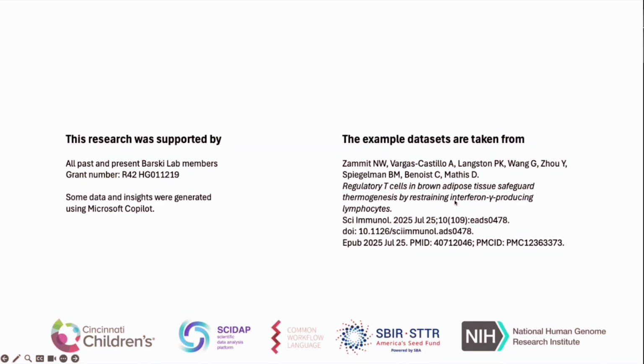Well, it will depend whether we will have any project that will require that type of alignment. Currently, we use STAR for alignment, so I haven't tested. Oh, I think Artem has the answer. I can answer this, and yes, in some cases, some pipelines use Kallisto for pseudo alignment to some of the genomes, and those outputs can be used as inputs into DESeq. At least in the previous version of DESeq. I'm not sure if Misha added it to this one.